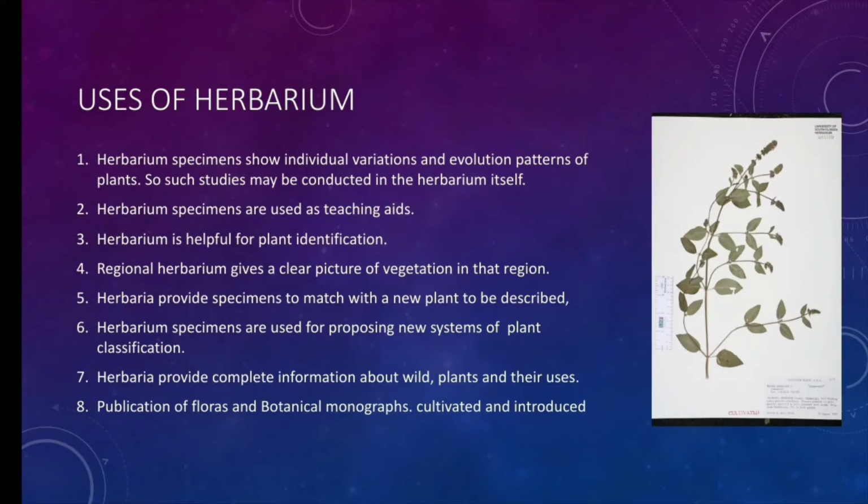Herbarium specimens show individual variation and evolution patterns of plants, so such studies may be conducted in the herbarium itself. Herbarium specimens are used as teaching aids. Herbarium provides specimens to match with the new plant to be described. Herbarium specimens are used for proposing new systems of plant classification. Herbaria provide complete information about wild plants and their uses.